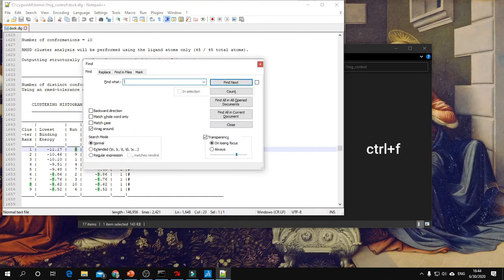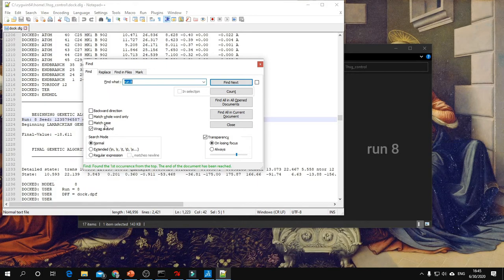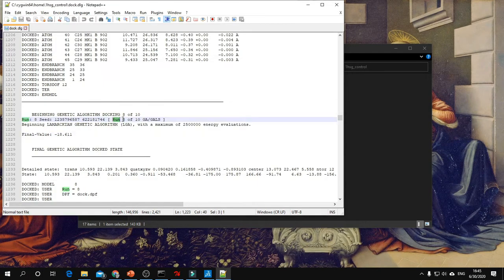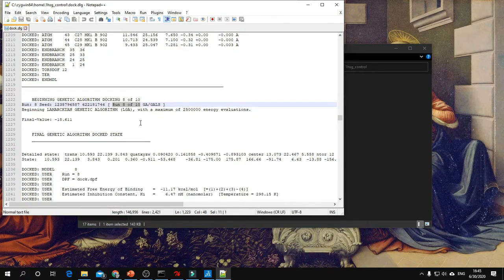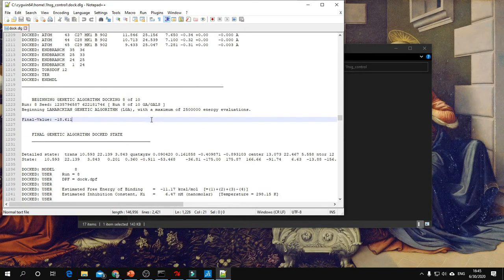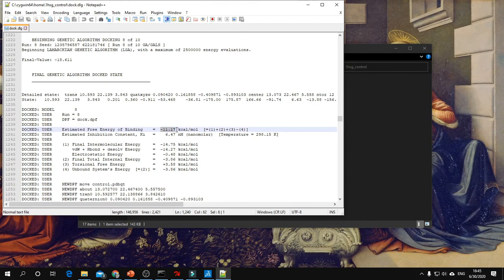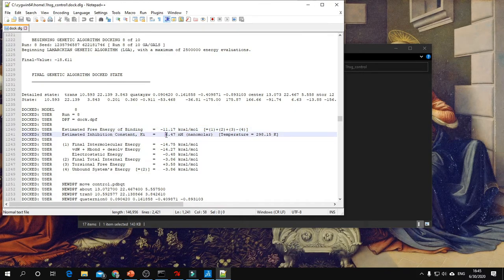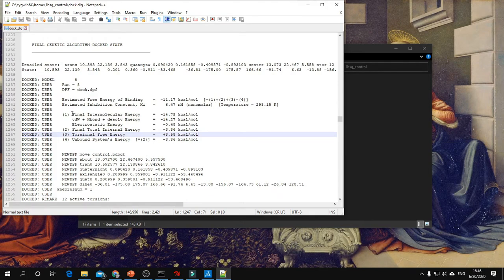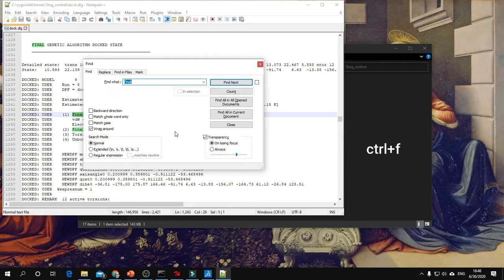Here it states this is run number 8 out of 10. Under this you can find the lowest binding energy: -11.17 kilocalorie per mole, the inhibition constant Ki: 6.47 nanomolar, and other details about the energy. You can also look for the root mean square deviation value by pressing Ctrl+F again.